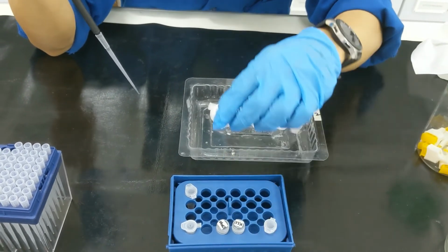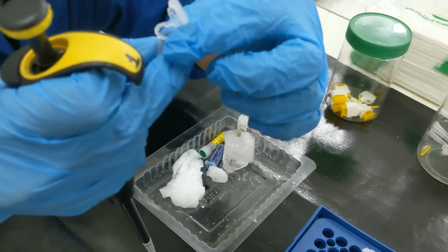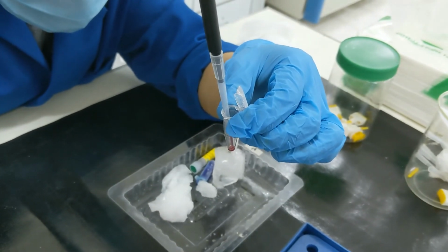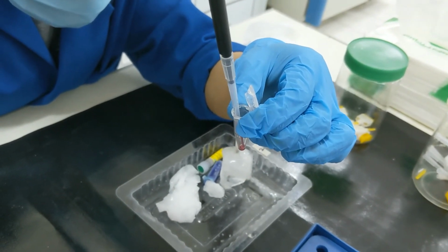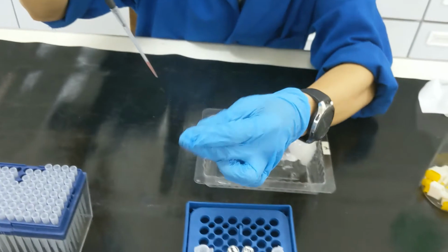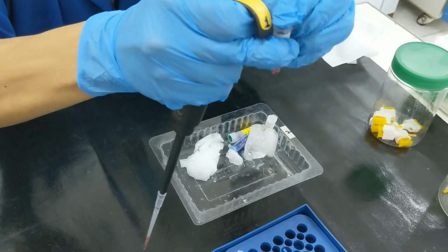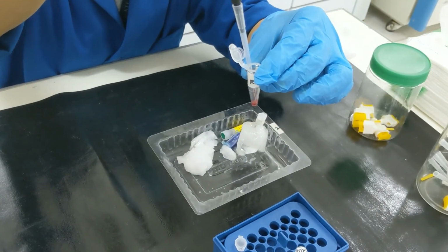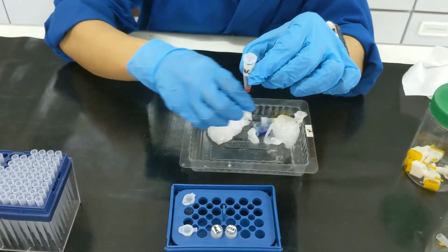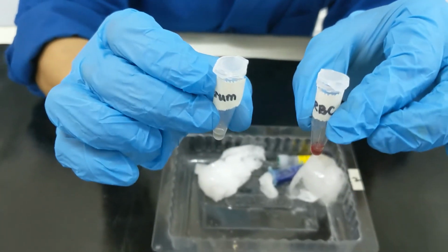So take note, we are labeling this with RBC, but this is our cell lysate sample. So let's just make sure that we have aspirated all of the supernatant and transfer these to our cell lysate sample. So we now have two samples to be analyzed, the blood serum and the cell lysate sample.